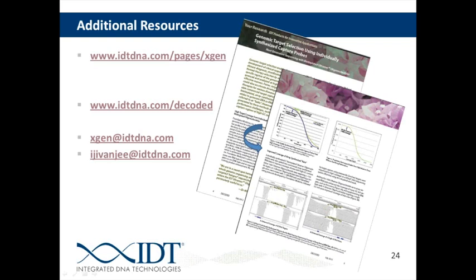Okay. And actually, I think I'm going to give this method question to Ibrahim. It's regarding enriching for GC-rich regions and basically performance of xGen Lockdown probes. How do they perform for enriching for GC content? I think that's actually where our probe technology excels, the high GC regions.